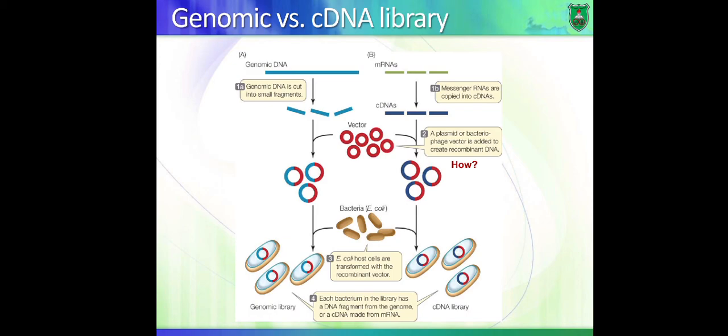We take colonies representing a specific clone of cells, okay, and we can freeze them or do whatever, and we create our own library, a DNA library, in a freezer. Okay, so whenever I want to study a particular gene, I would go into the catalog, and I would search for where this gene is located. That is, in which vial containing which bacteria, which shelf, freezer, lab, whatever. Okay, so that's the whole idea.